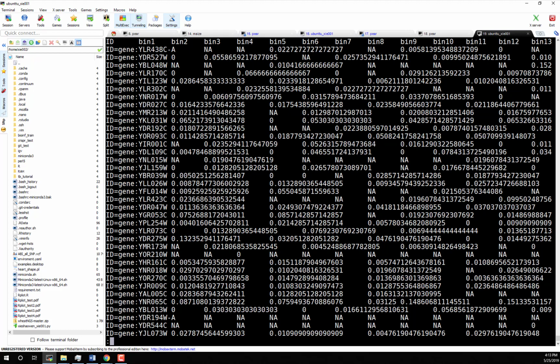But whole genome bisulfite sequencing relies on the reads and also relies on the cytosine. Basically, it relies on the reads only. So if there are no reads, we couldn't get the methylation level, and we couldn't have any conclusion. We couldn't say the methylation is low or high. But for ChIP-seq, if there's no read, we can say, okay, the signal is low.